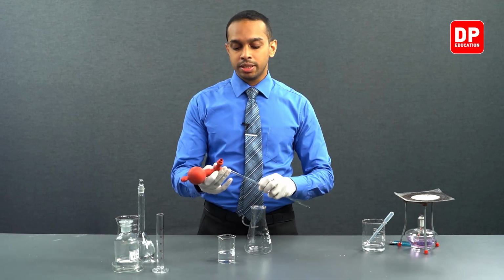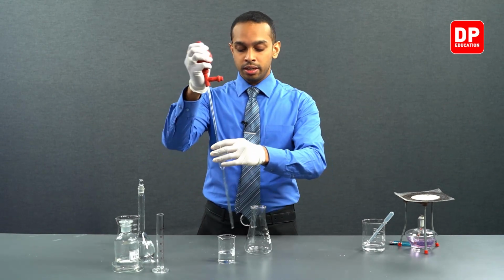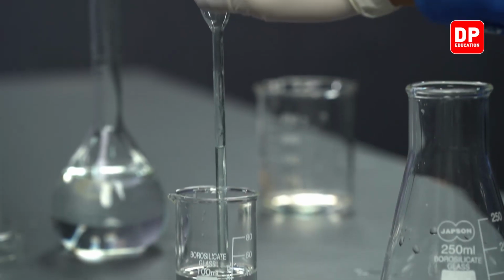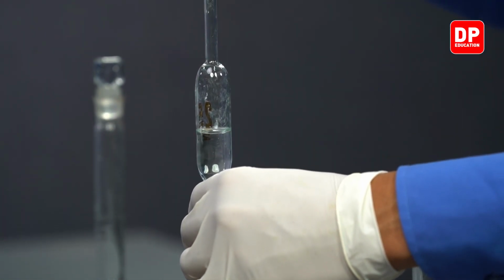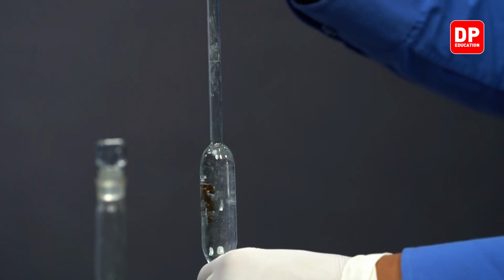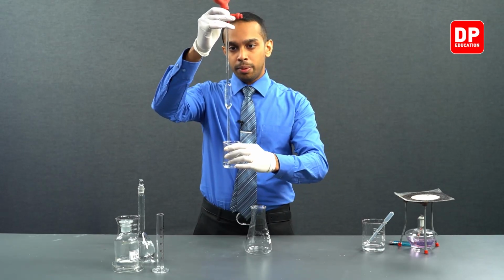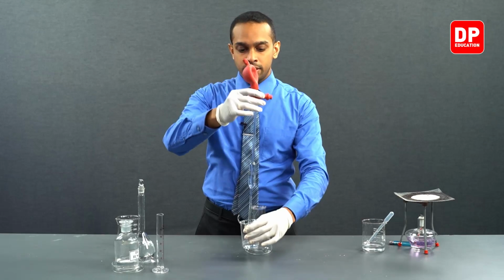Since we have to measure exactly 25.00 cubic centimeters of potassium oxalate, we have to make sure that we use our pipette and measure exactly 25 cubic centimeters. As you can see, with the help of the pipette filler, you are able to measure exactly 25 cubic centimeters.